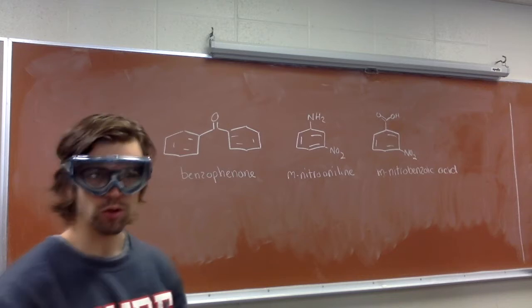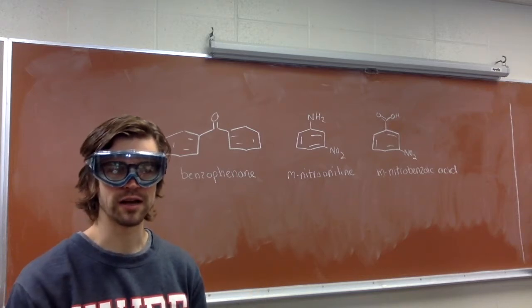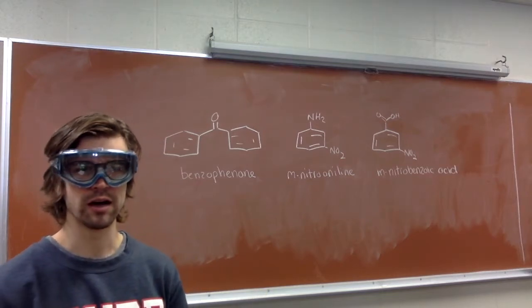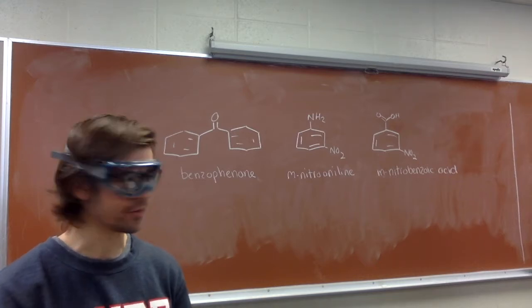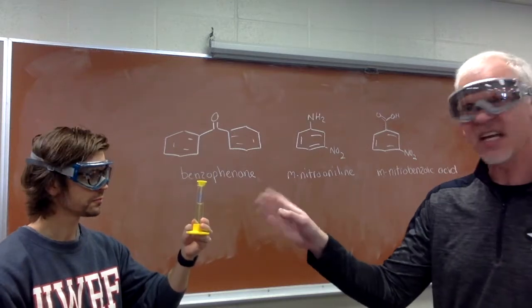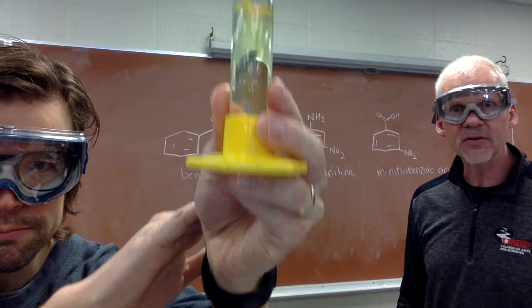And the goal of an acid-base extraction, or of an extraction in general, is to separate out components of a mixture, or essentially purifying molecules, so removing different components based on their solubilities. And I don't know if you noticed, but the solution has a light yellow tinge to it. I don't know if that came through on the video, but you can see it's a light yellow tinge.